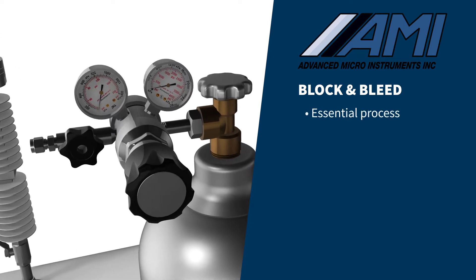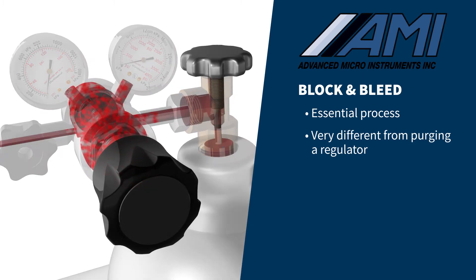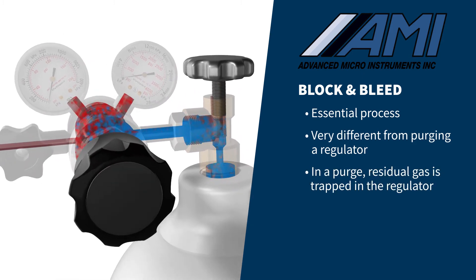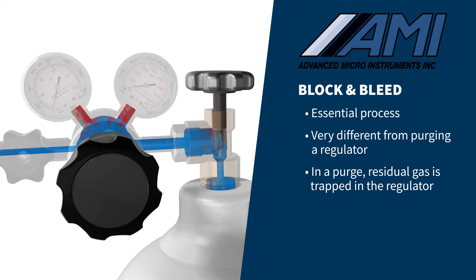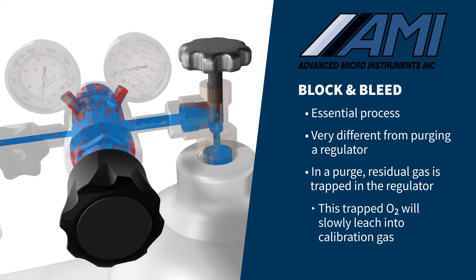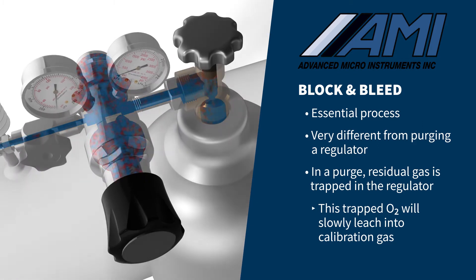A block and bleed is essential and very different from purging a regulator. In a simple purge, gas flows inefficiently through the regulator, leaving trapped residual oxygen within dead legs of the pressure gauges and regulator. A purge will not effectively evacuate the high levels of oxygen left in the regulator, and will slowly leach into the calibration gas stream, resulting in significant errors in the calibration process.